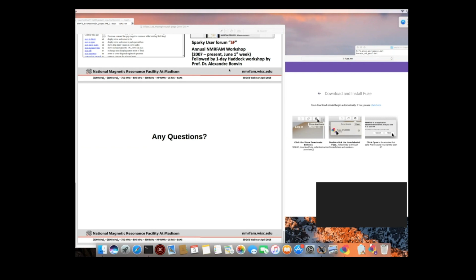Well, TALOS-N does not really require a lot of time. But CS-Rosetta does. BMRB utilizes the HTCondor system and Open Science Grid that has been developed at the University of Wisconsin. For, let's say, ubiquitin, it would take like 3 or 4 hours, and maximum 7 or 8 hours, I think. But if your protein is big, let's say 50 kilodaltons, it's not really big for other biophysical methods, but for NMR it's a really big protein. A 50 kilodalton protein, let's say it'll take a week, I think.